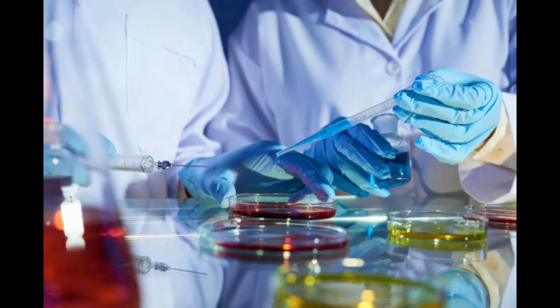We picked Serratia marcescens for a very specific reason. Serratia marcescens is a gram-negative rod-shaped bacteria. The only reason that we pick it for this lab is that Serratia, when it grows on a medium, when it colonizes, produces a red pigment.